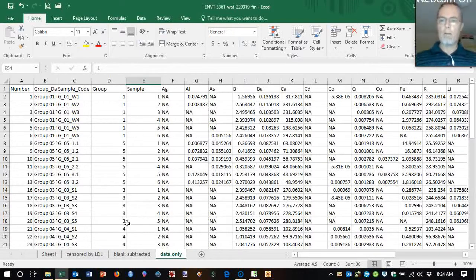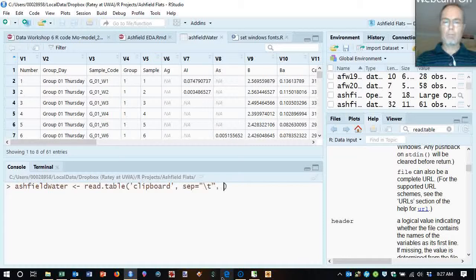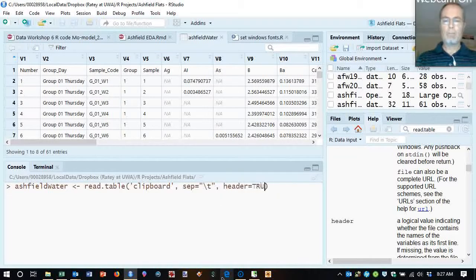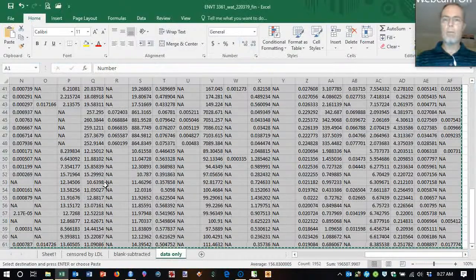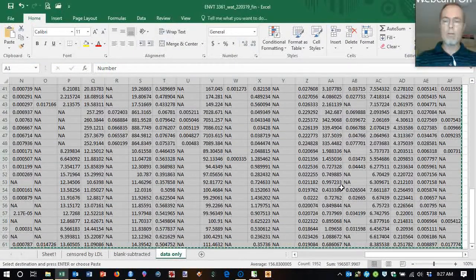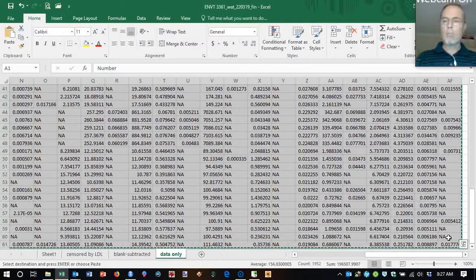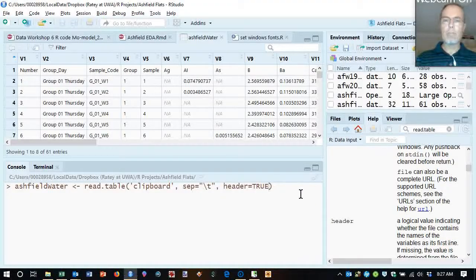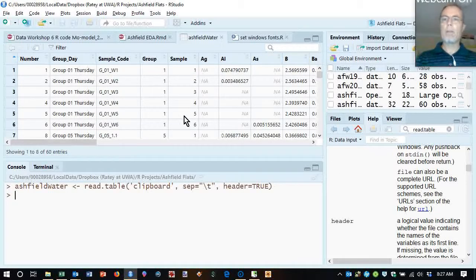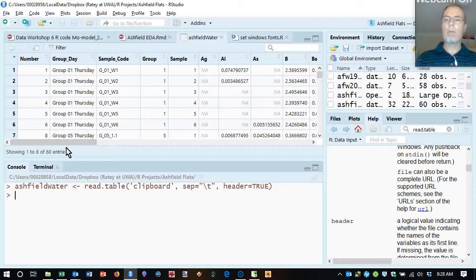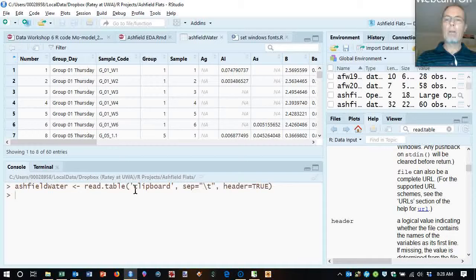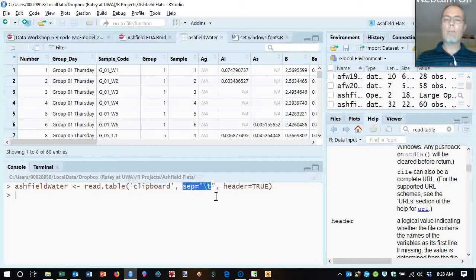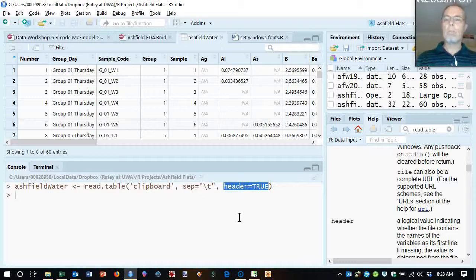Let's go to RStudio and read it in. That would put the contents of the clipboard into a data object called Ashfield Water. So I've selected the whole lot, control C to copy, and there's Ashfield Water in. What we need to do is specify the clipboard. We need to say that the separator is a tab, that's how it comes out of the clipboard if you copy from Excel. And header equals true meaning the first row is our column headings and we're all done.